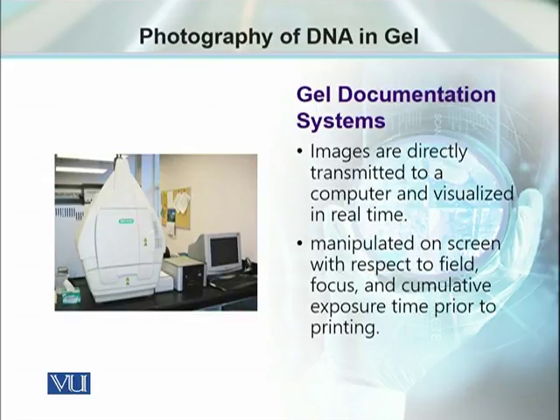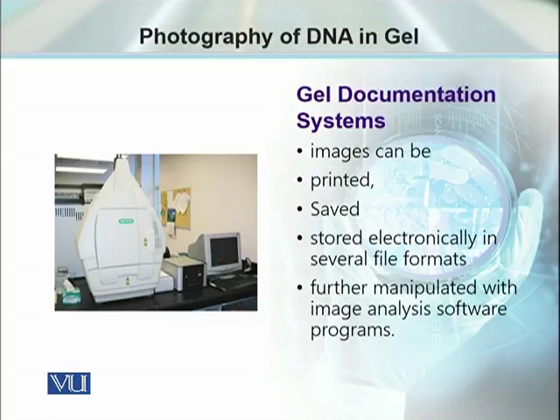One step ahead, the gel documentation systems are connected or supplied with computers. These computers have the installed softwares, and this kind of system has made it possible to observe the DNA bands in real time and to manipulate the screen, and then to take the picture in different formats, save it in different formats, and even then we can manipulate the image using different softwares. We can label them, we can analyze their density, and number of other functions can be performed.